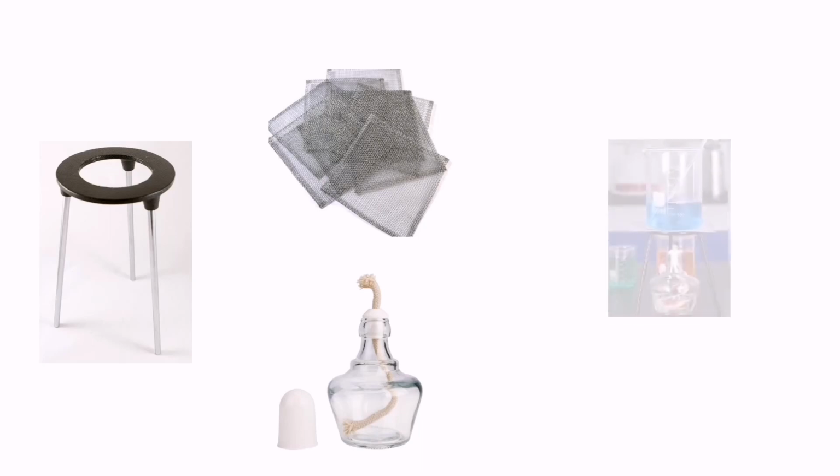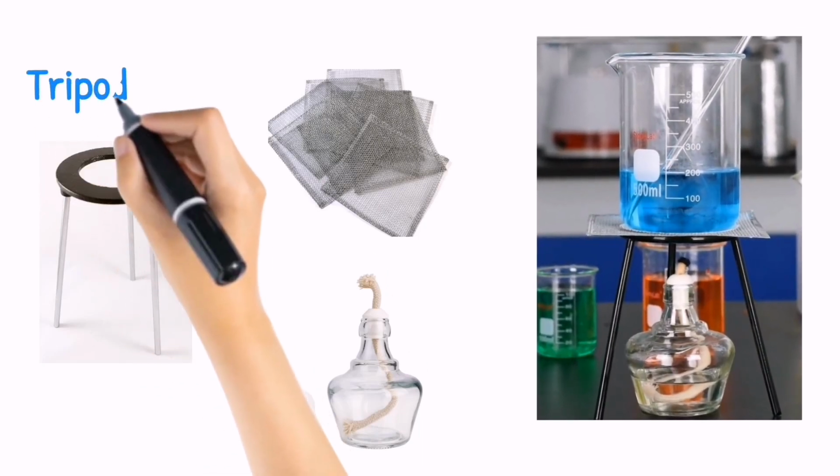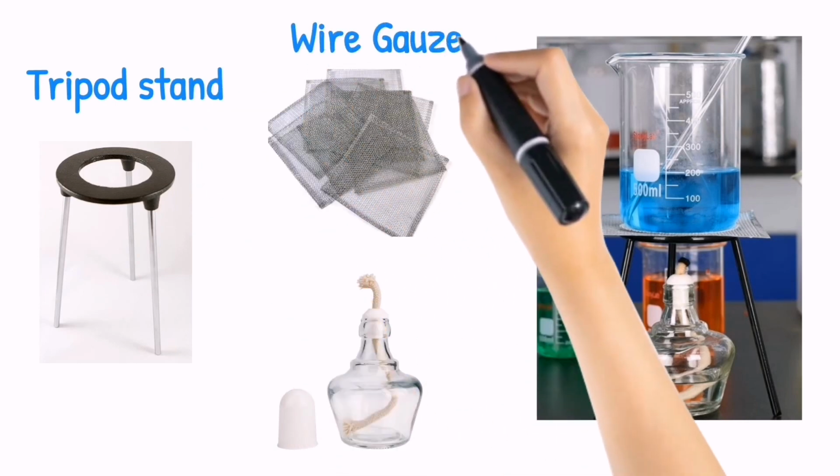Tripod stand, wire gauze, alcohol burner, all these are set up like this to heat a solution or chemicals in a beaker, test tube or flask, etc.